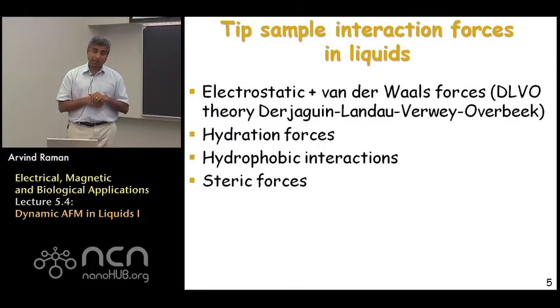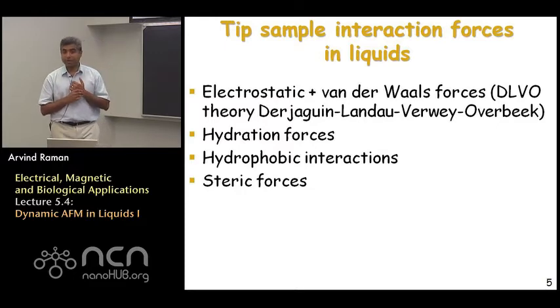Now, broadly speaking, the forces that are important when dealing with dynamic AFM in liquids are listed here. We're going to focus today on the electrostatic and van der Waals forces through what's called the DLVO theory. We'll talk briefly about hydration forces, hydrophobic interactions, and steric forces, all of which also play an important role. So let's begin with talking about electrostatic and van der Waals forces.